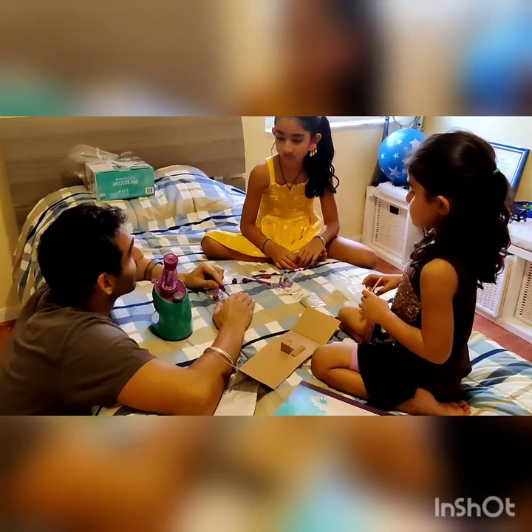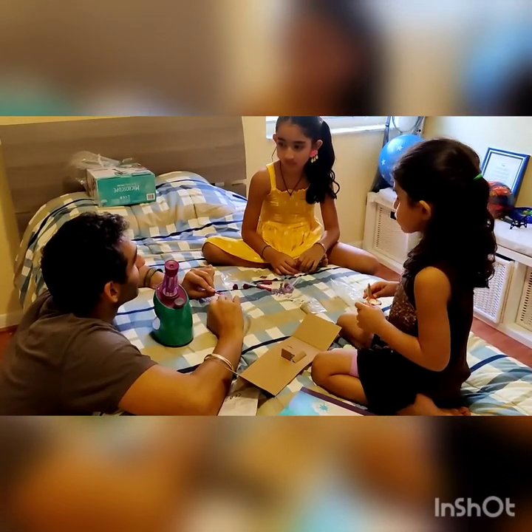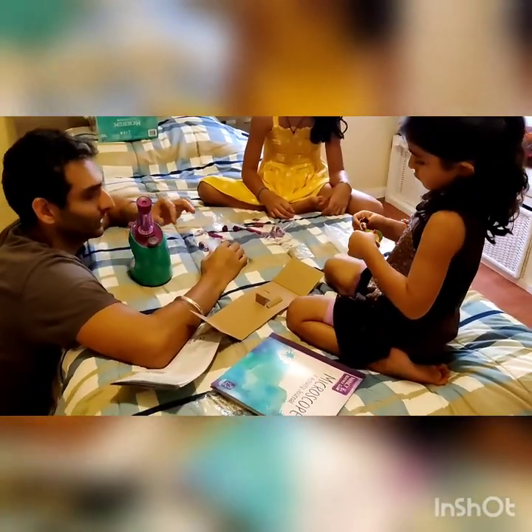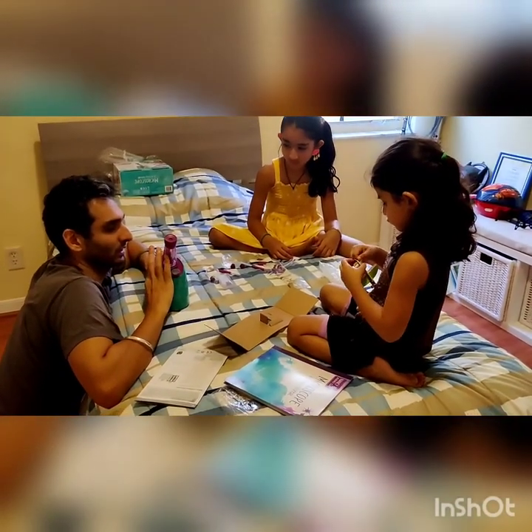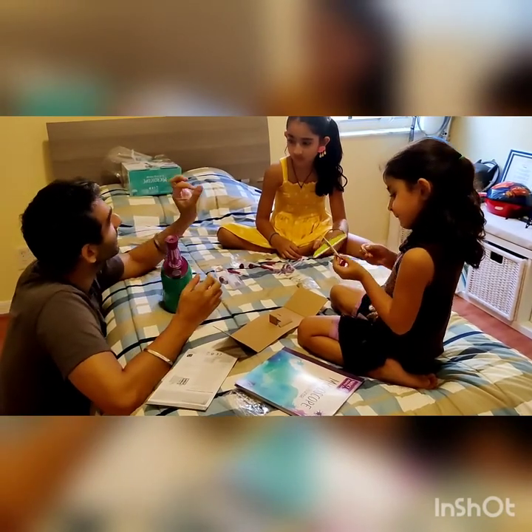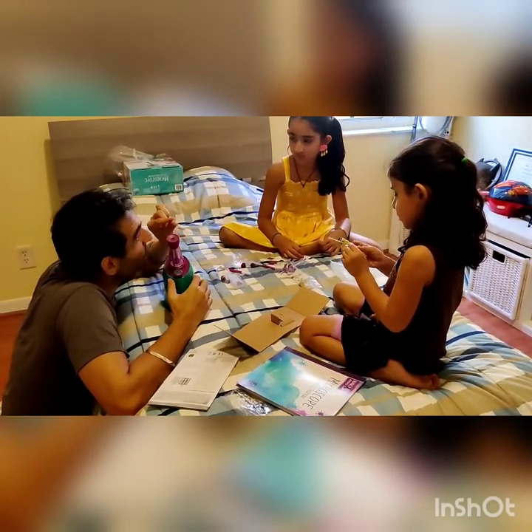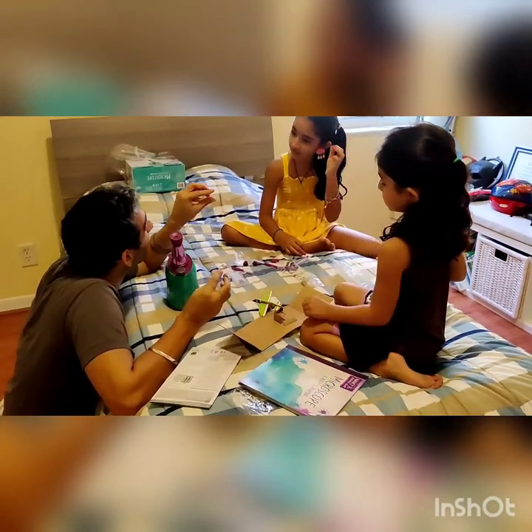When it becomes colored, all the cells of that onion, which are very thin, will become purple. Then you take the slide with the cover slip and put it underneath this. This will hold the cover slip tight. Once you do, you look from here and you'll see those same tiny dots that are so small you can't see them. Now you'll see them big. You can see the cell and look inside the cell.